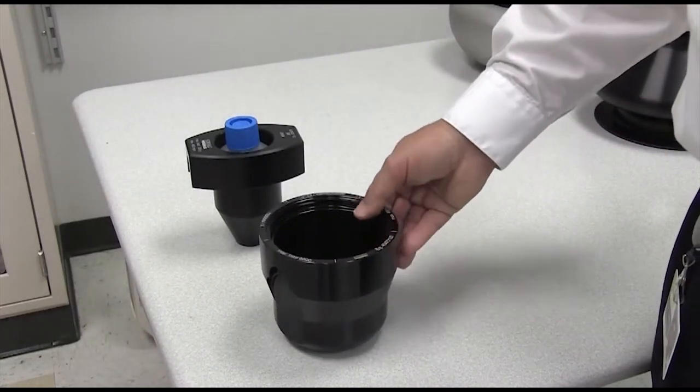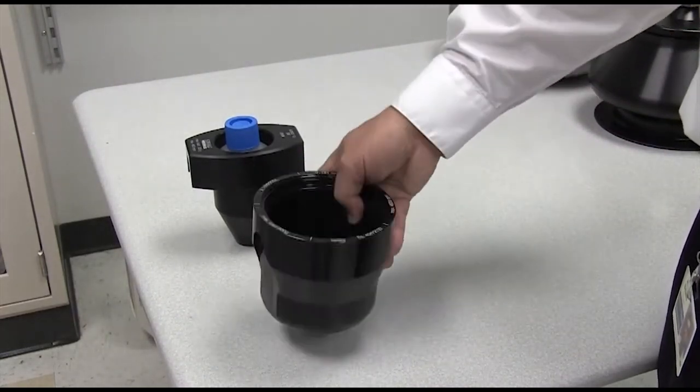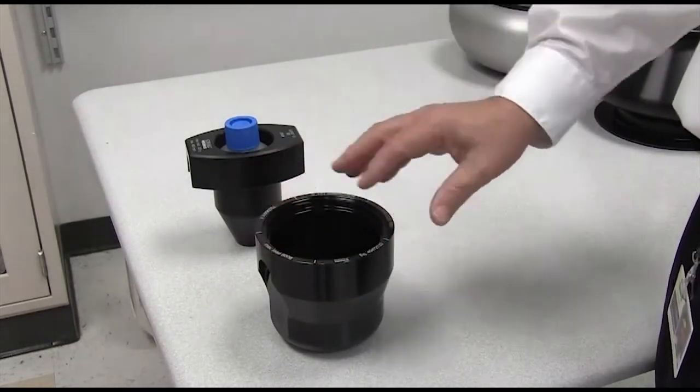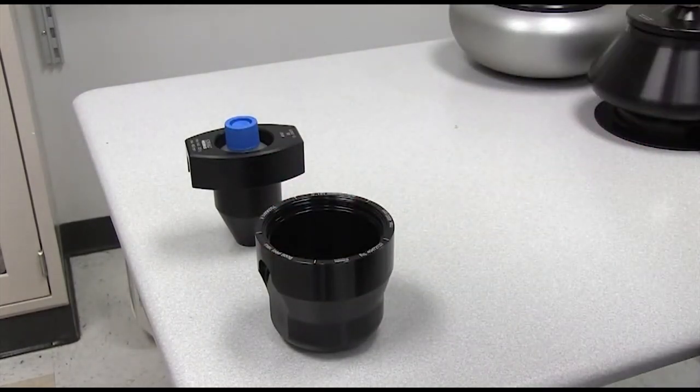Here's another bucket from that same centrifuge. It's just a standard open bucket that would take either a large bottle or a wide variety of those adapters.